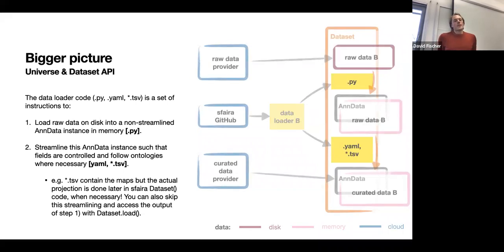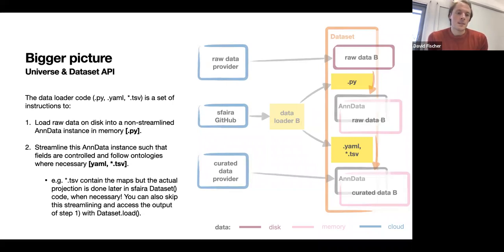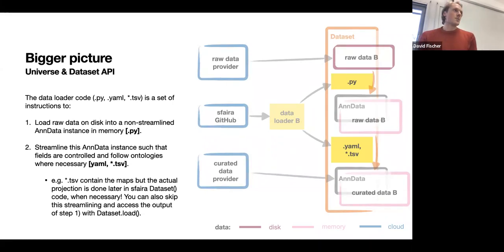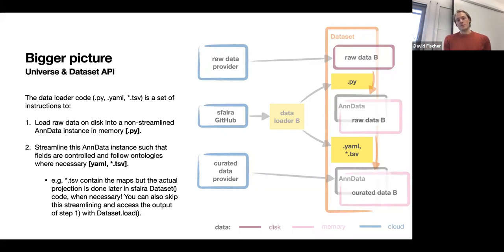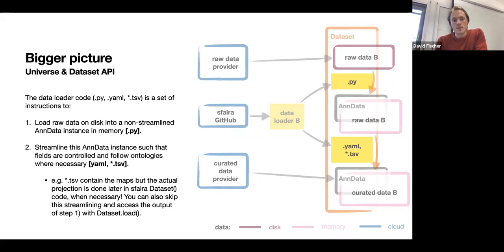Specifically, a data loader is a Python file containing the loading code — referred to as the .py file — and metadata, which consists of a .yaml file (a text file format that's very intuitively readable) and TSV files containing metadata maps. So .py, .yaml, and .tsv files are the core components of one data loader — the code that defines one study.